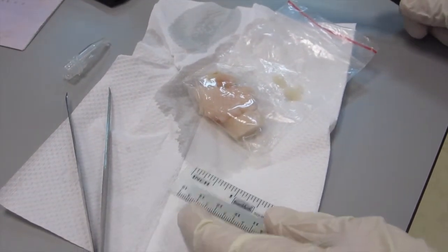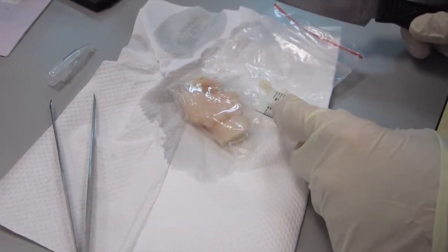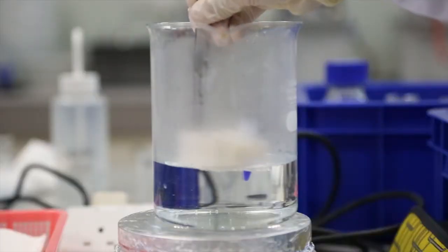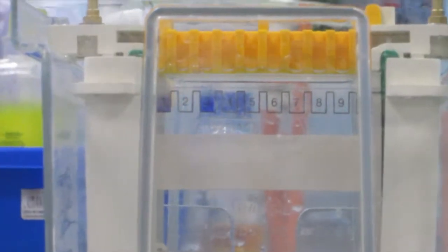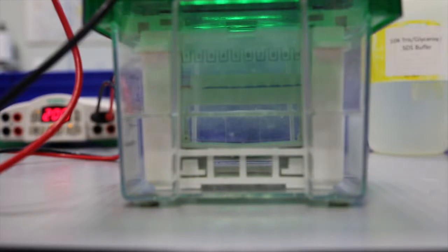In this experiment, we will determine the molecular weight of the protein sample through electrophoresis. The weight can be determined by comparing the retention factor of the sample against the calibration graph of molecular weight versus retention factor of the standards.